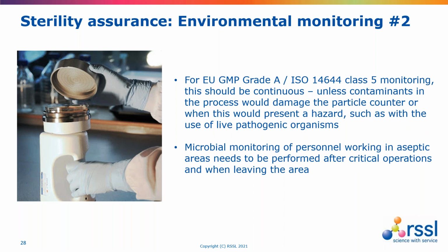And that would include also the monitoring of personnel working in the aseptic areas, particularly after performing critical operations and prior to leaving the area in the form of finger and gown plates. And there should be a system in place to disqualify personnel with problematic trends, and a system in place to requalify personnel.